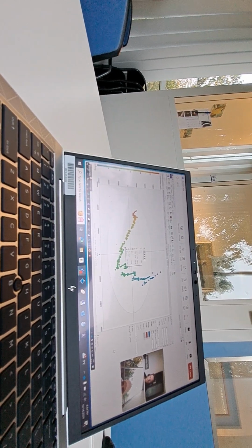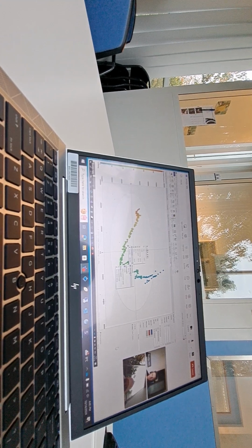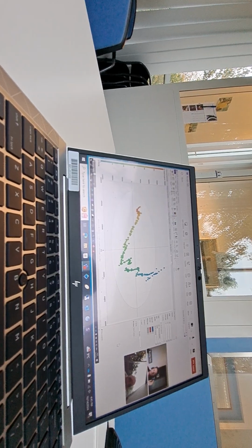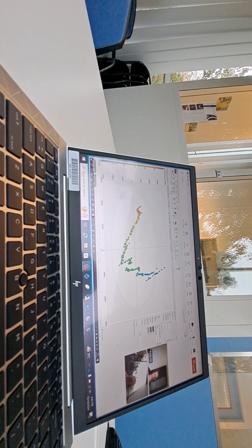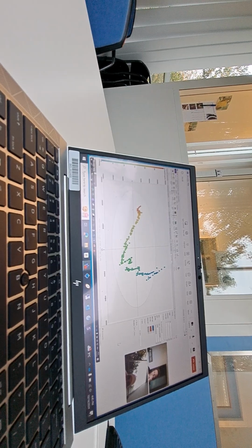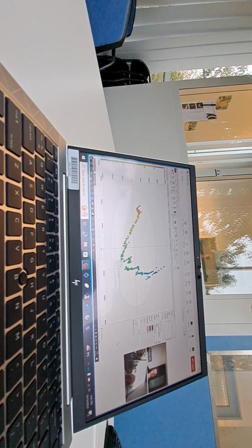And that's maybe useful if you have a certain format you like. You can format plot, save as default. Meaning each plot you will make will use the same format, so that you don't always need to redefine everything. But yeah, like the PCA, the scores plot and coloring according to pH. This could be nice.